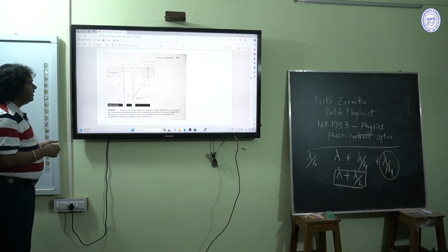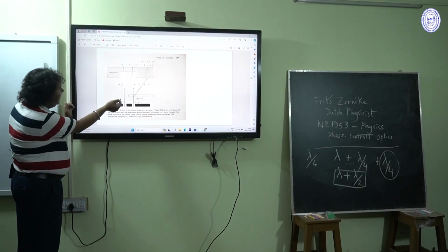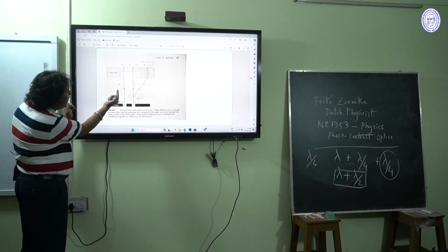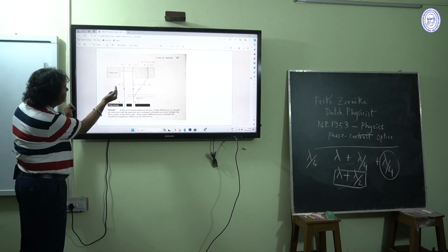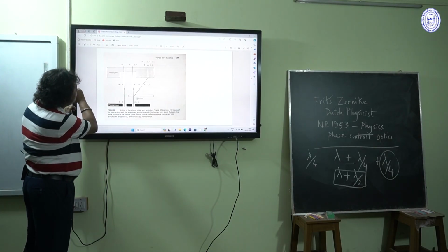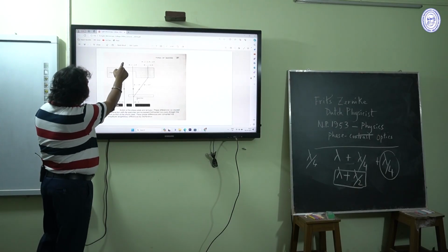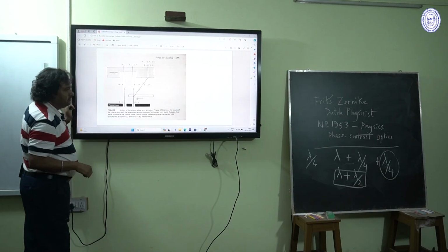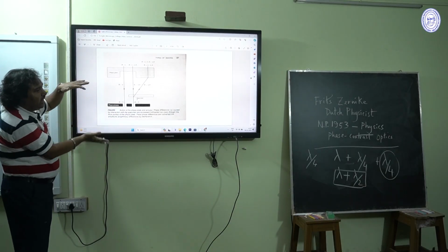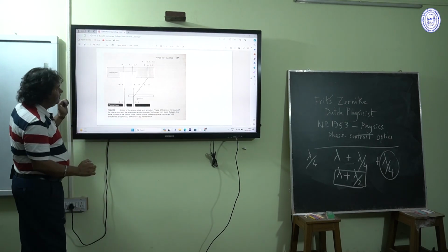Here, this ray is passing through the gap of the phase annulus, and the phase change is 0. So the final phase will be x, that is its original wavelength. Here there is no change.